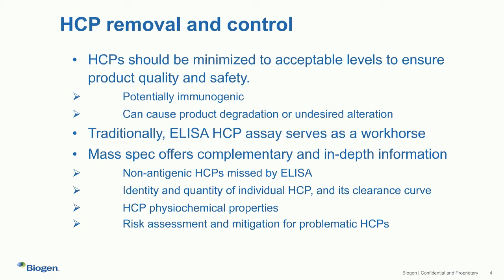The assay relies on use of antibody reagent that's generally targeting all the population of the HCPs that are potentially present. So that could then report a total level of HCPs as a result. That assay has good throughput and is rather user-friendly, so it has been commonly used for a while.